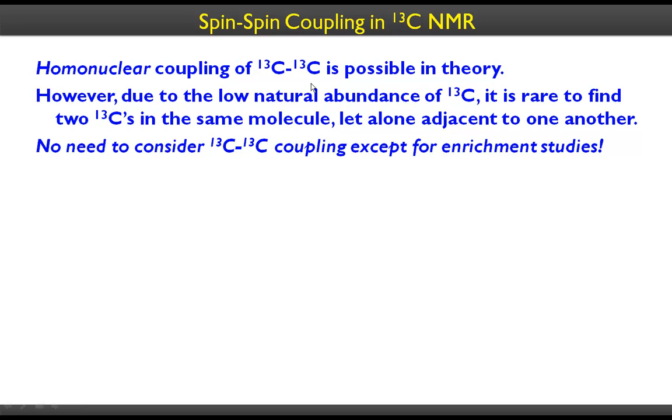Theoretically, it should be possible to see the carbon-13 coupling, but the probability of seeing that is very small. It's somewhere in the noise that we saw in the carbon NMR, right? Because what is the probability of having a carbon-13 adjacent to another carbon-13, unless you have enriched your sample by starting off with carbon-13 nuclei? Those are called isotopic labeling syntheses, but we don't do that kind of synthesis. We just normally take the naturally abundant carbon compounds that are derived from petroleum sources.